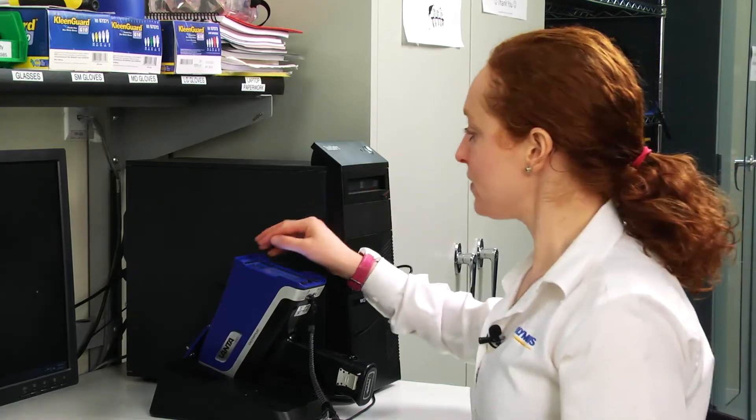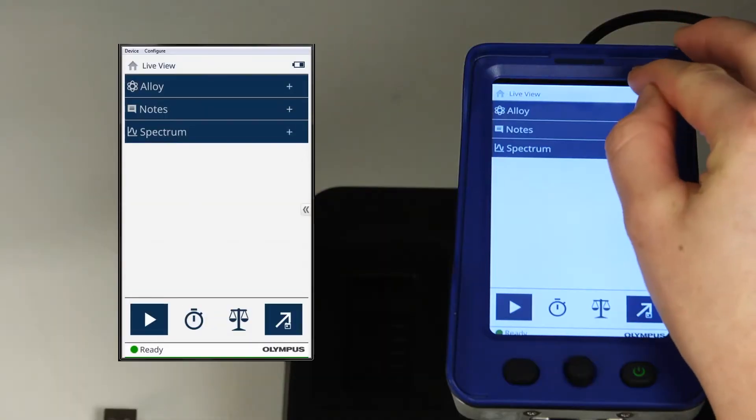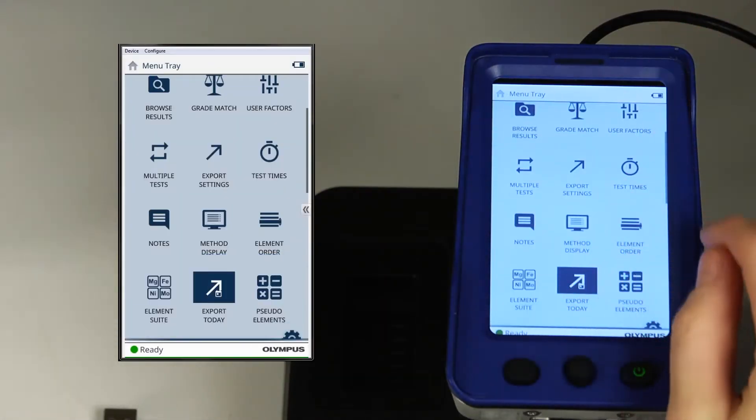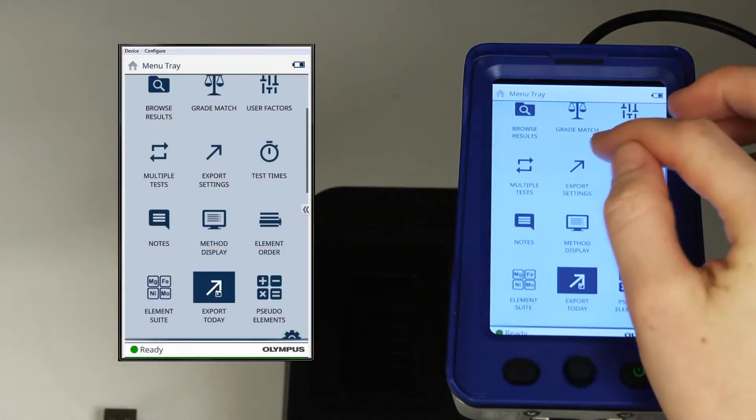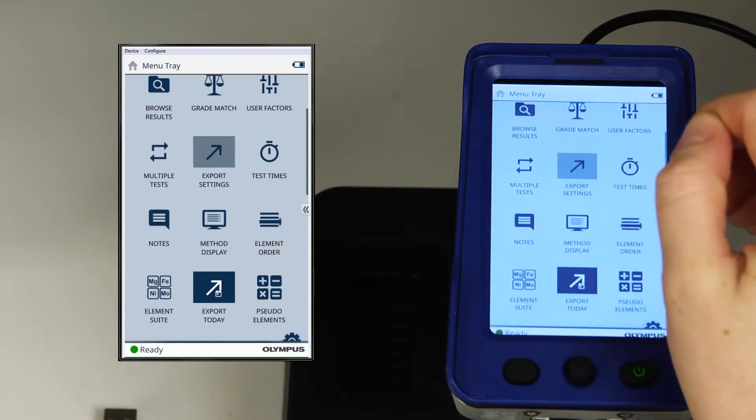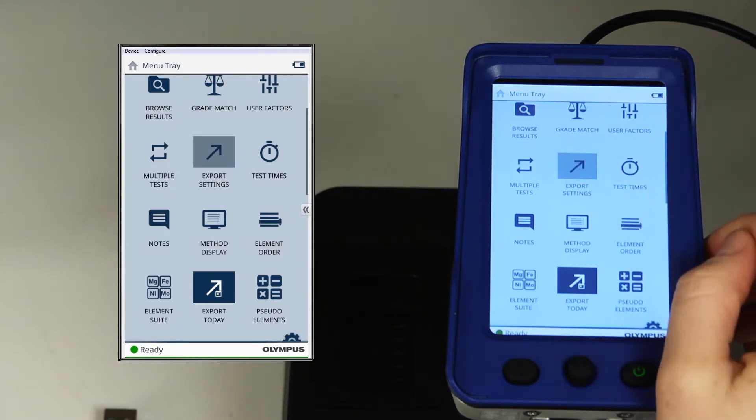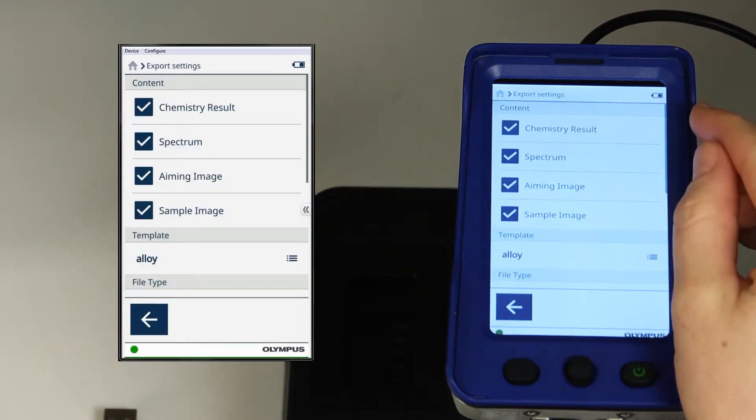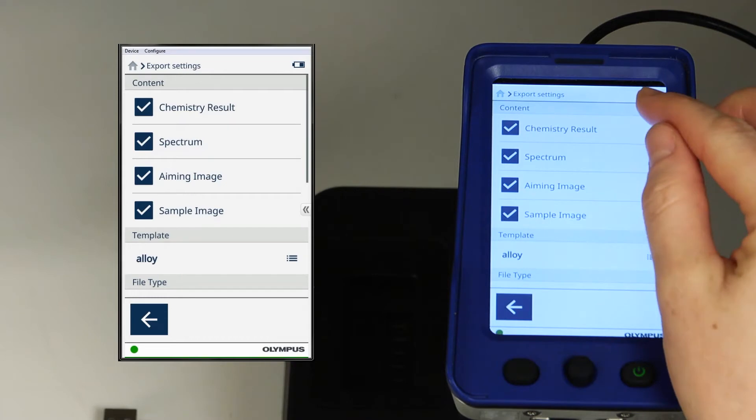To begin, swipe down the main menu on the Vanta. Select Export Settings. In this menu, you'll see the content that can be exported.